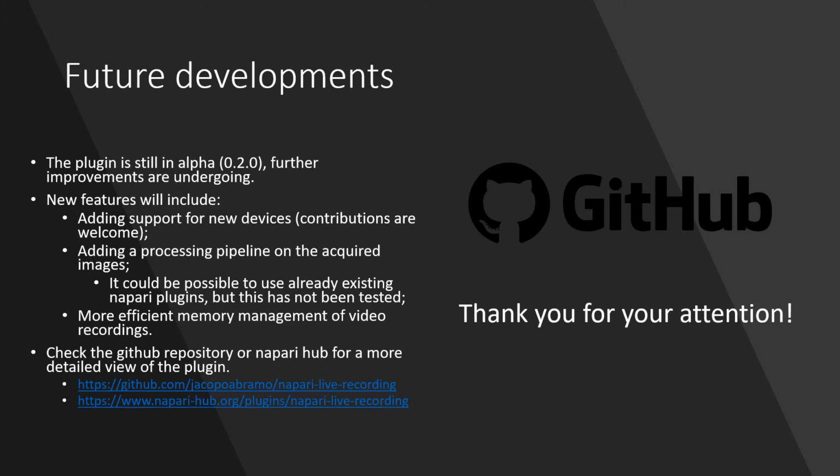The plugin is still in alpha stage of development, and there are further developments which are still undergoing. New features will include the support for new devices, and for this all contributions are welcome for any new devices that want to be added into the plugin, and also adding the possibility of implementing a customizable processing pipeline on the single acquired images, or eventually the live recording, or the album, or the video recordings.